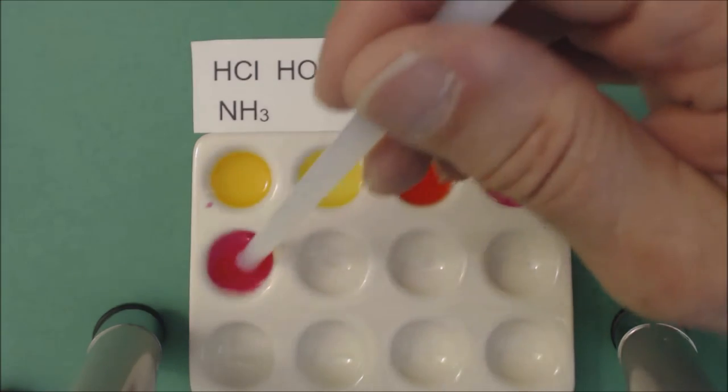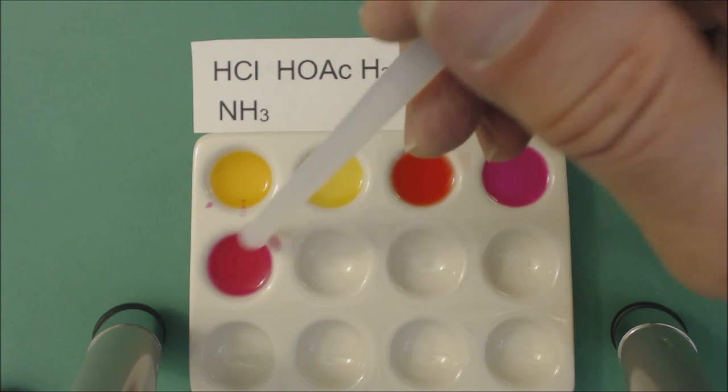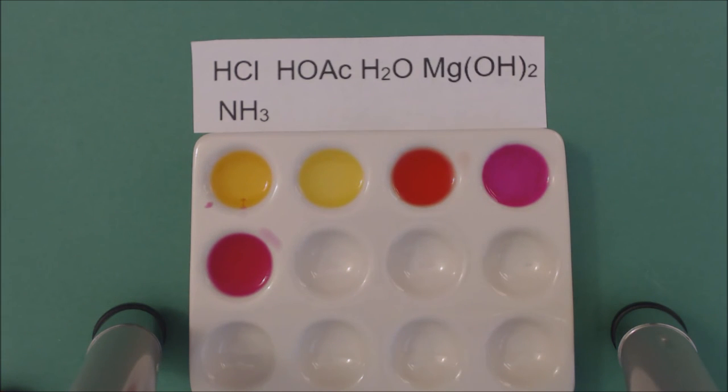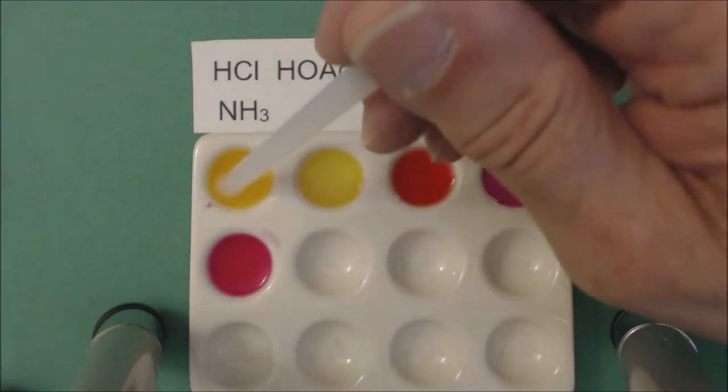Although the milk of magnesia, because it has that milky color, looks a little different than the ammonia, they're both in the pink range. Let me just mix this up a little better.